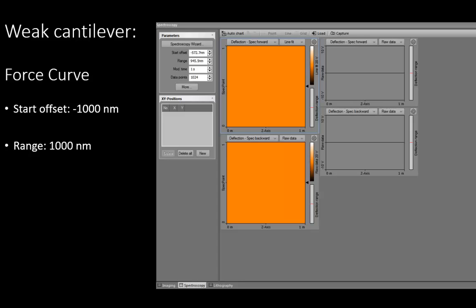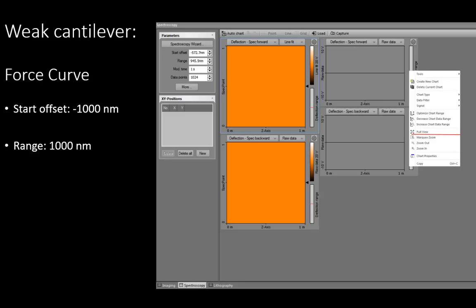If you don't see the whole force curve on your chart, click the right button and select full view. This will display the whole range of your data. Think about whether your force curve makes sense and whether you need to obtain a new set of data.